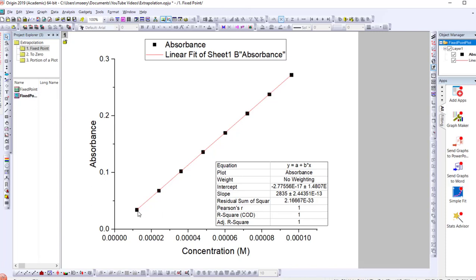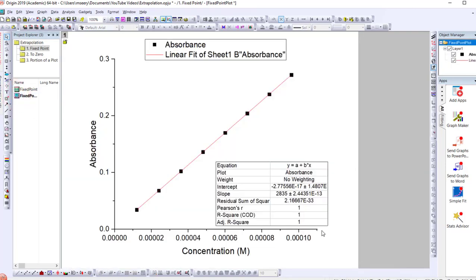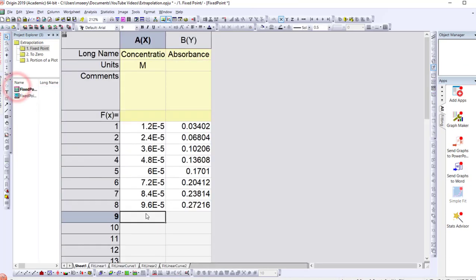In the first example we have a linear plot with a trend line added. We want to find a particular y value at a given x value by extrapolating the plot further. If we know the equation of the line we can just substitute in a value, but here we show how this can be done for more complicated plots. Using concentration and absorbance data, let's say we want to work out the absorbance at a concentration of 0.00015.